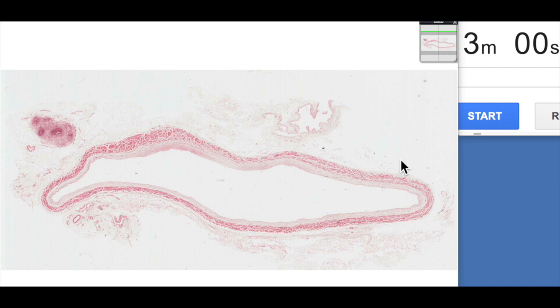G'day everyone, welcome to another episode of 3 Minute Histology with Jamie Chapman. In this episode we're going to be looking at the vena cava and then a few other blood vessel features, particularly looking at neurovascular bundles if we get time at the end. So let's start our three minutes.